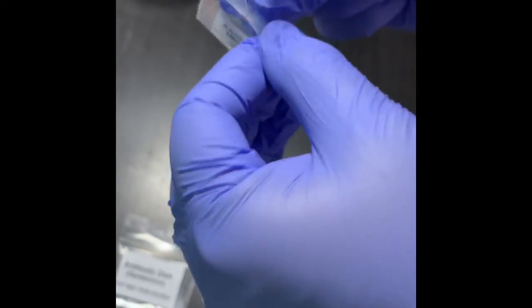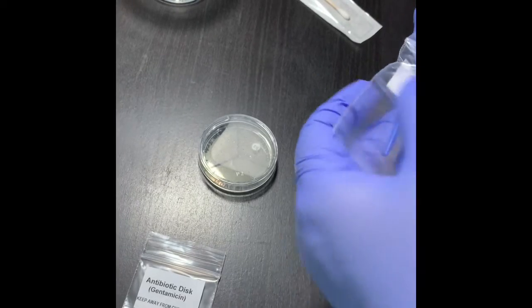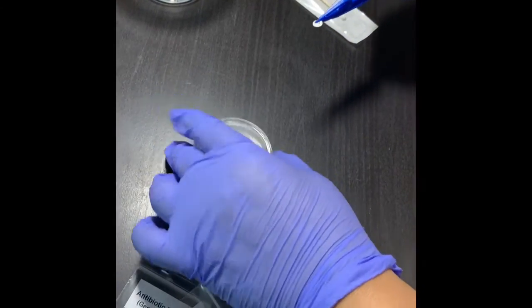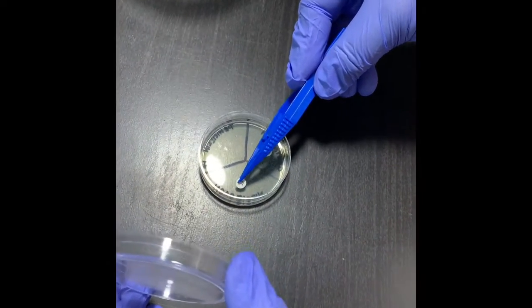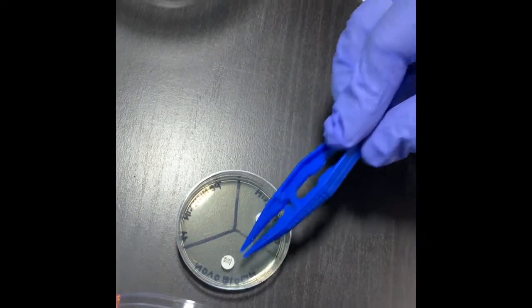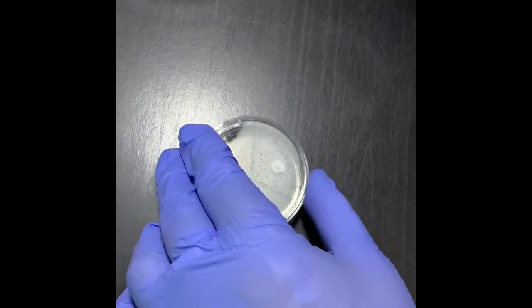In the same way I get that tablet and see where it says novobiocin, and put it at the center, because I'm trying to keep as much space on the sides so that I can calculate the zone of inhibition.